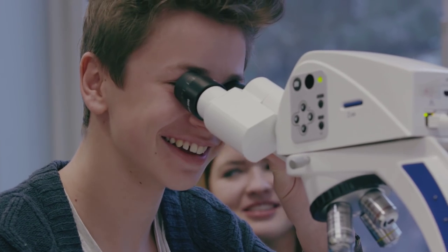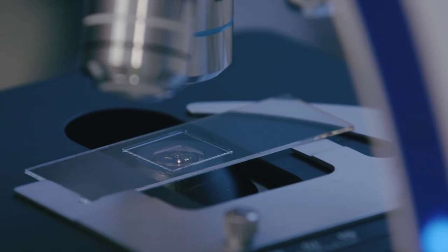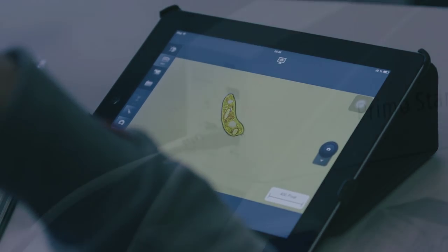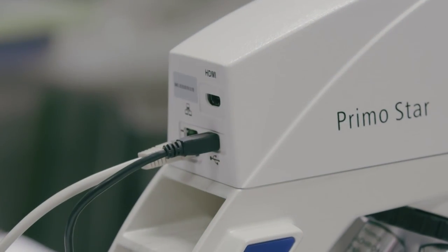Planktonic organisms are nearly transparent. To identify them properly, it's important that we see clear and crisp microscopic images.